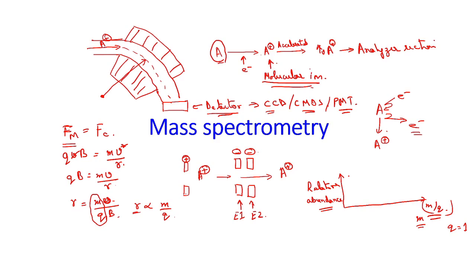However, say for example, this molecular ion, this molecule, it breaks into some B plus and some neutral fragments. Sorry. So we will be telling that this B plus is a charged fragment. Now this charged fragment may be either B plus, or it may be B plus radical, maybe. Plus there will be some neutral fragments.